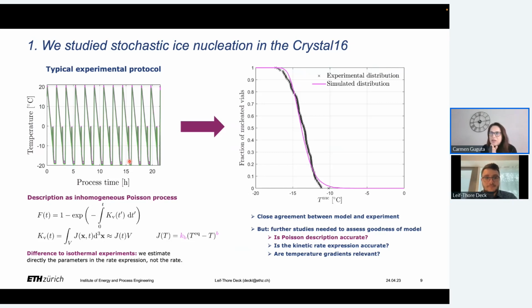And we have performed quite a few studies also looking at the cooling rate for induction time measurements, for example. We investigated several cooling rates. We looked at even 20 degrees per minute, super fast, or 5 degrees, or even lower.